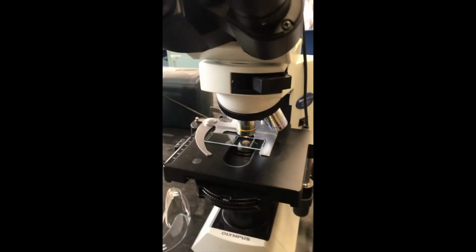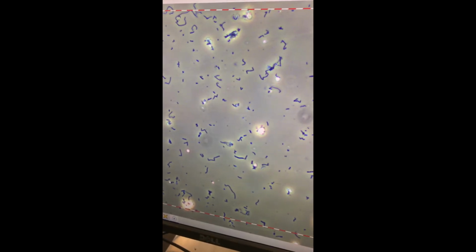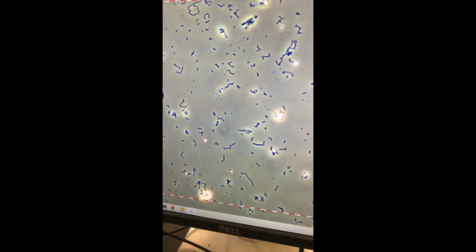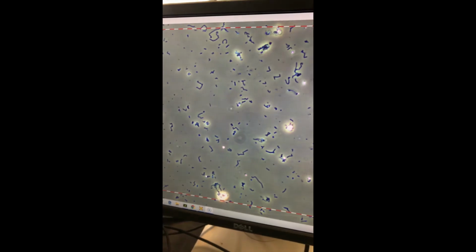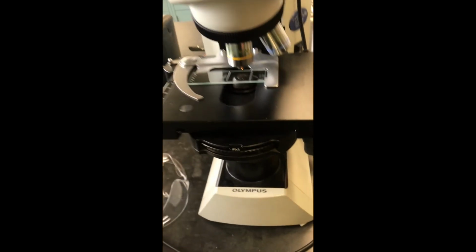We'll now take a look at a mixed culture obtained from the brine of fermenting cucumbers. Here we can see the specimen under the 10x objective, or 100x total magnification. The image seen here has already been focused and resolved. It's now time to adjust the magnification.